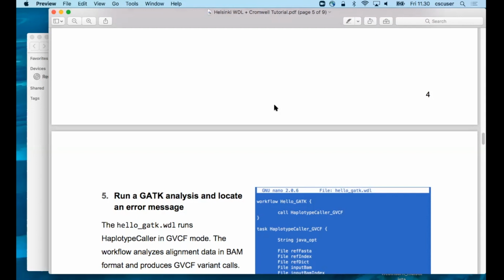All right, if you give this the all, it's like a verbose version of graph, and it tells you down here that it includes things such as the inputs. So when you're not in a live demo, try that out.